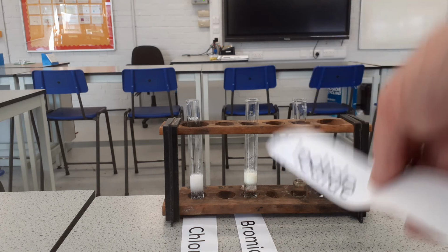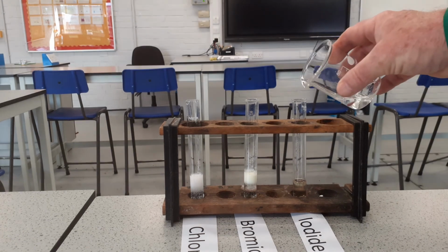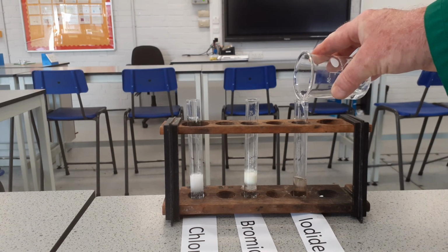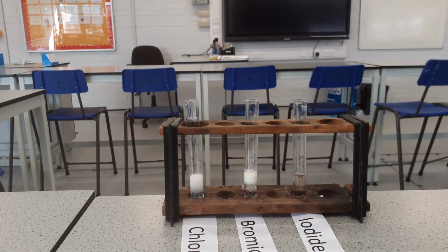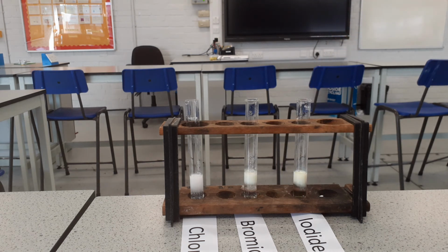Now, if I do an iodide last of all, my little bit of nitric acid, and then my silver nitrate solution. And here you can see this is much more yellow, so that's how we tell them.